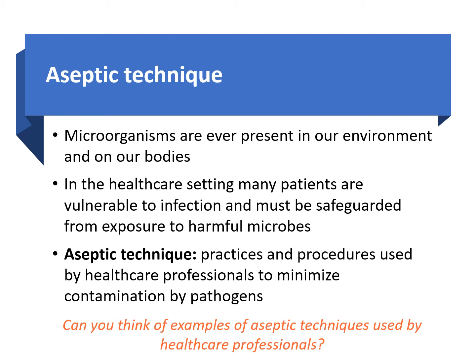They wash their hands in between patients. These are examples of some aseptic techniques that they follow. And again, some of these aseptic techniques are definitely shared between healthcare professionals and microbiology students in a microbiology lab setting. So we're going to discuss more about those aseptic techniques in just a minute.